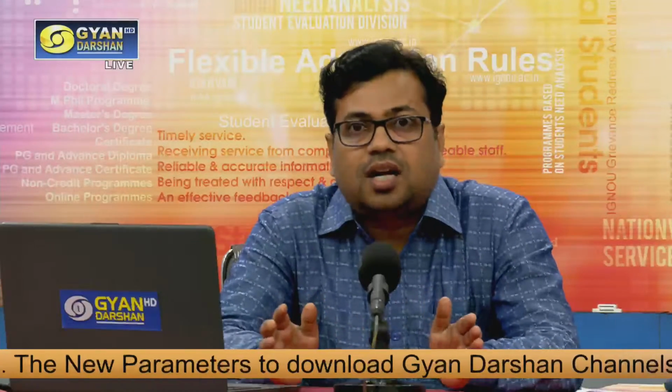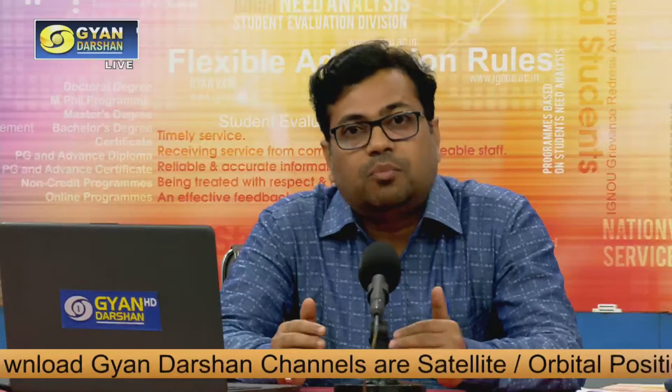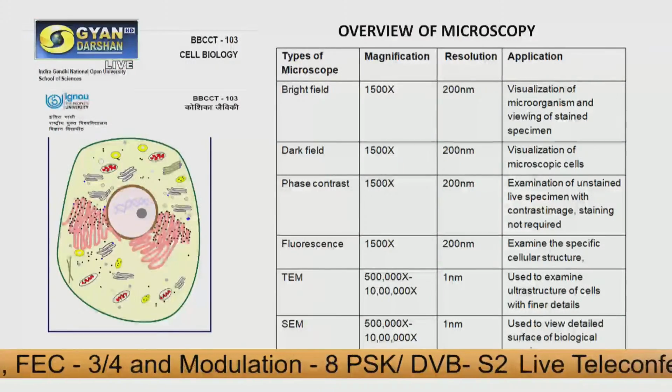In our surroundings there are many kinds of tiny microorganisms available within the body and outside the body, in water and in the earth. To study these microorganisms and the structure of cells, we require the microscope. At the level of size and morphology of cellular structure, we require scientific equipment such as the microscope. You can see here the overview of microscopy.